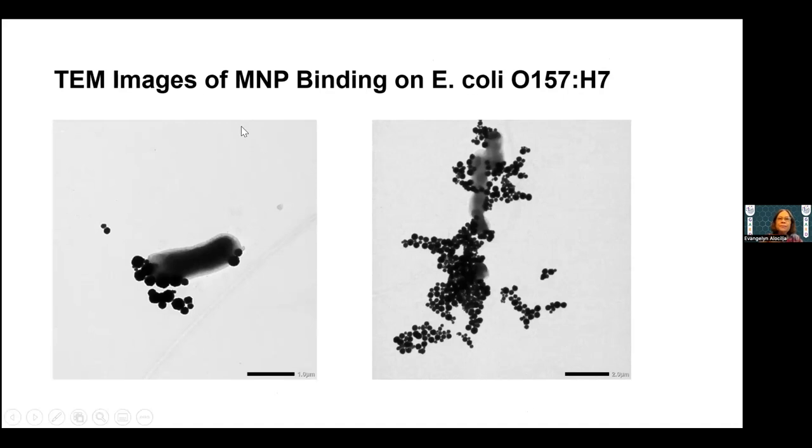These are TEM images of E. coli O157:H7. As I said, there are specific binding sites — the magnetic nanoparticles do not attach all over the surface. Some theory says it's charge-based, but we believe it's not only charge but also carbohydrate-protein or glycan-protein binding at the cell wall surface. You can see magnetic nanoparticles at the tip and bottom of the bacterium, and they attach very strongly to the flagella.